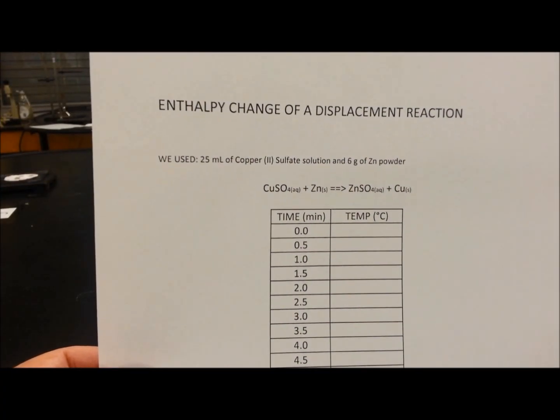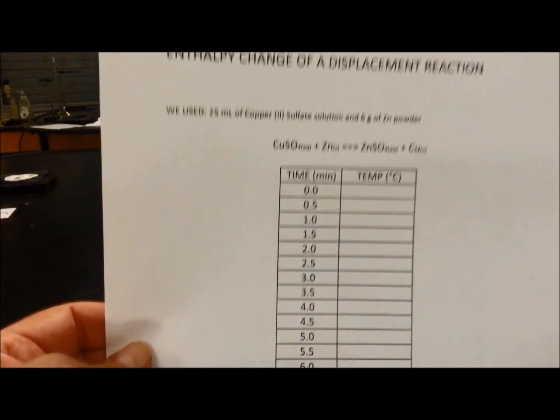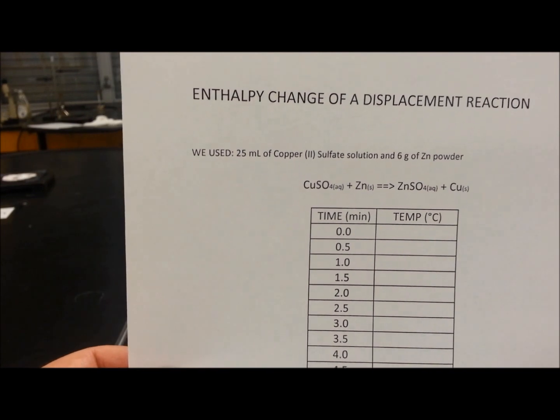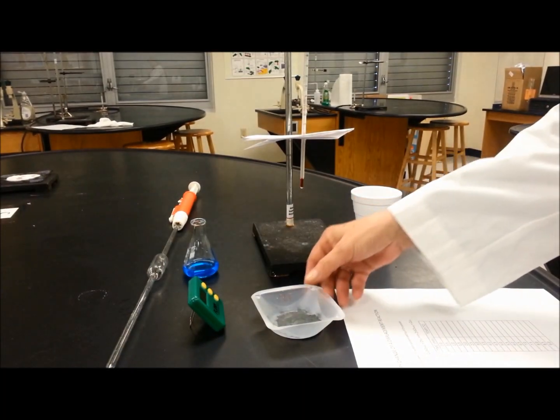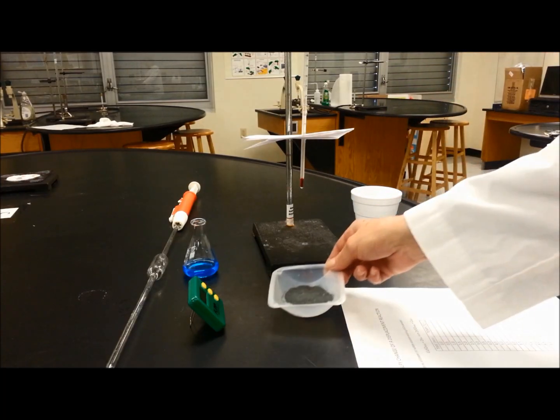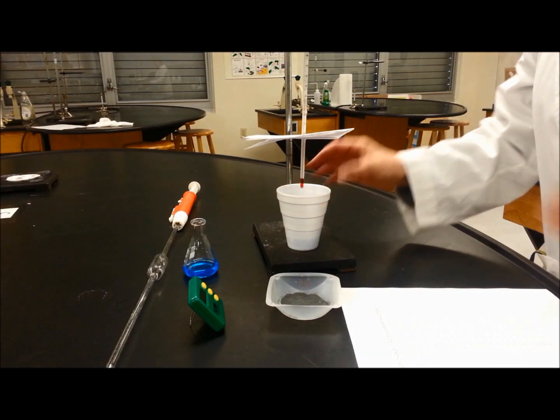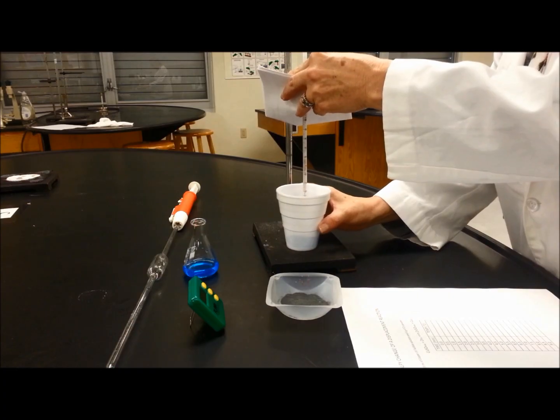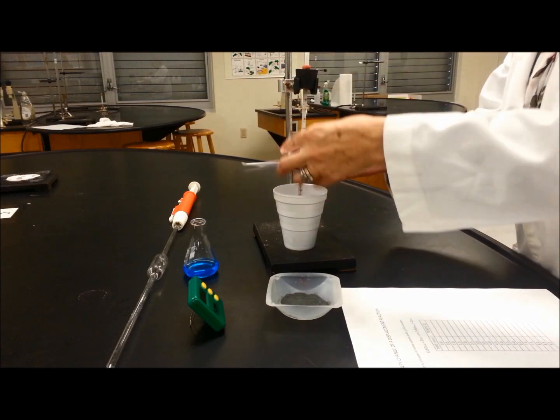I already prepared the data table that I'm going to fill out up to 9 minutes. We are using 25 milliliters of copper sulfate solution, 1 molar, and 6 grams of zinc powder. Be sure that the zinc is completely powdered with no clumps, because that can slow down the reaction. Then we measure the correct height for the thermometer so the bulb is inside the liquid.